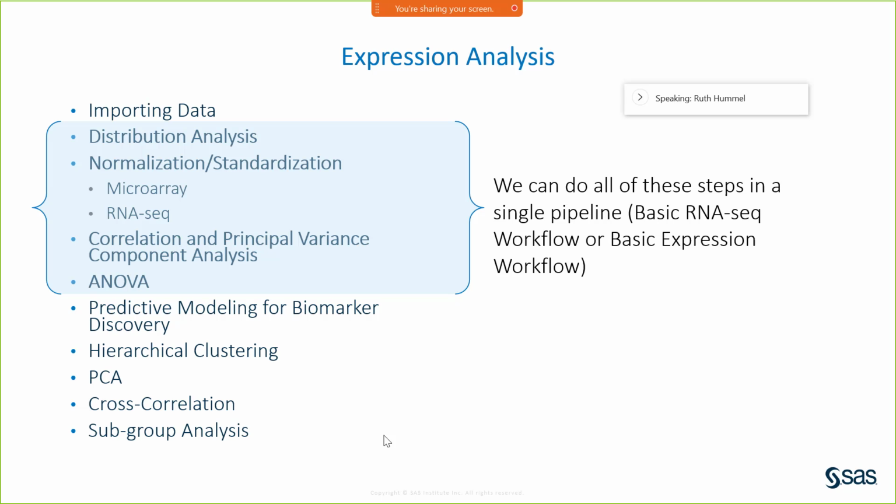And then in addition to those standard things that are in the workflow, we could also look at predictive modeling. We could look at hierarchical clustering, principal components analysis, cross-correlation, subgroup analysis. There's a number of other deeper statistical things that we could also do with expression data.